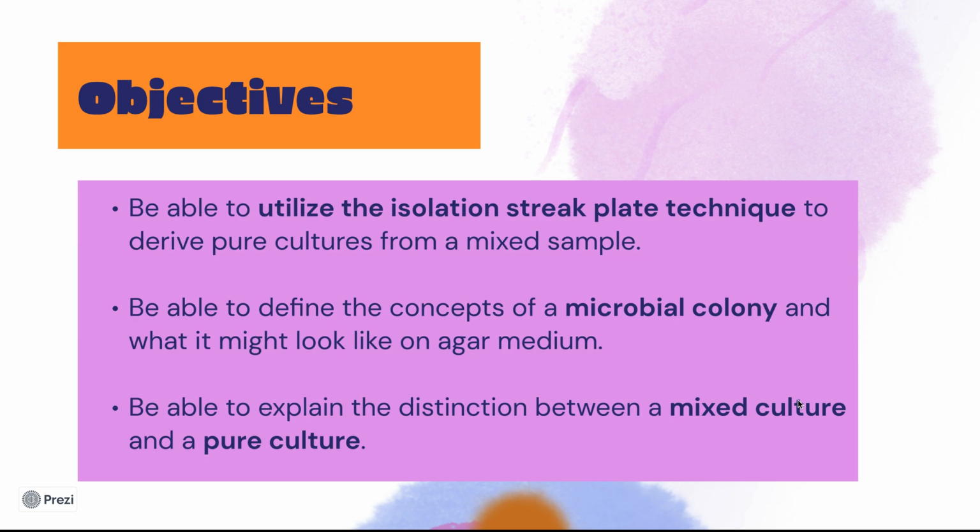All right, so for the objectives here, the first one is you're going to want to be able to utilize the isolation streak plate technique to derive pure cultures from a mixed sample. You're also going to be able to identify and define the concept of a microbial colony and what it might look like on an agar medium.